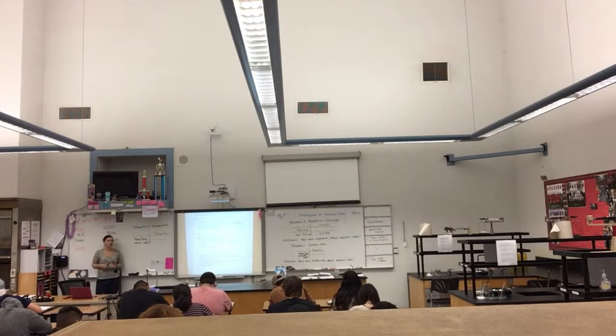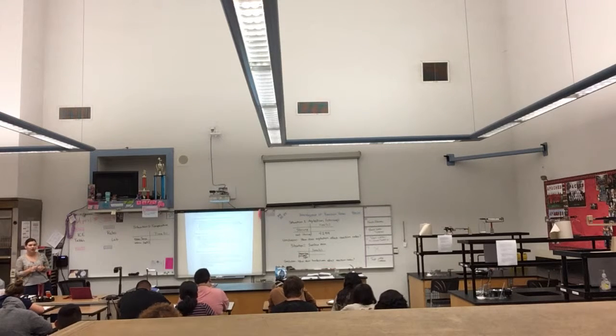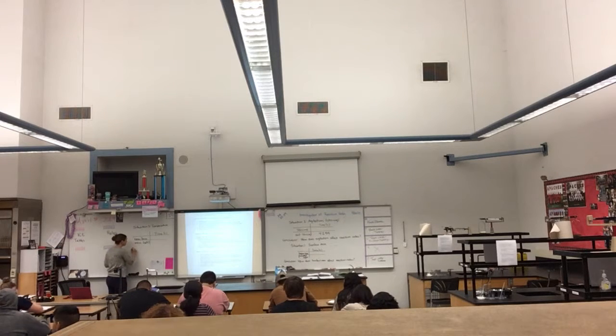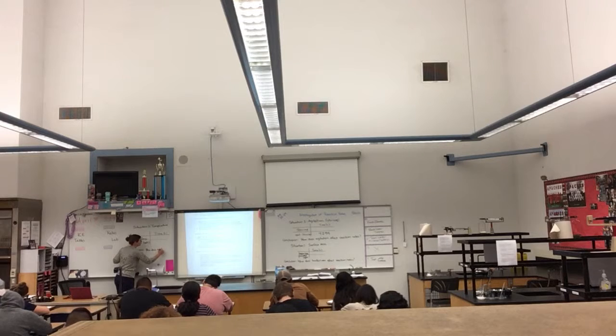And then you take your beaker off. It shouldn't be hot to the touch. You can move it with your hand. And then you're going to look at the difference in time to dissolve. I only have one hot plate per table, so you will have to share the hot plate between the 2 lab groups. So pay attention to that, be courteous. Underneath your data table, you're going to write your third and final conclusion. And you're going to answer the question, how does temperature affect reaction rates?